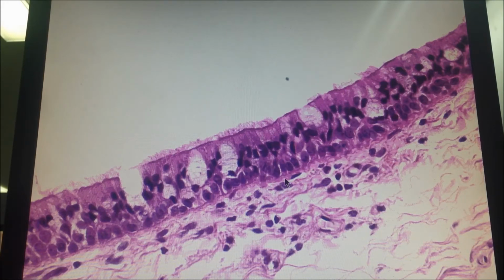Let's look over here. هذا. What separates between the epithelium and the connective tissue? Is the lamina ولا basement membrane؟ شو نسمي هذا؟ شو الbasement membrane؟ شو الbasal lamina؟ Why? مظبوط. Why you call it basement membrane? Excellent. This is a light microscope. In the light microscope you see the whole basement membrane. If you want to separate it into basal lamina and reticular lamina, you have to bring an electron microscope. But this is the basement membrane. يعني هون بنشوف the basal lamina and the reticular lamina.